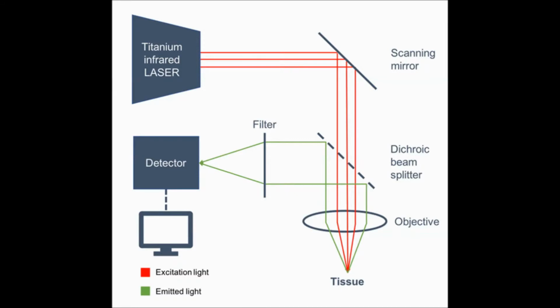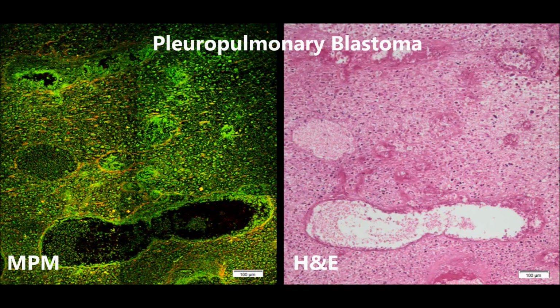This laser scanning technique is already being used in diagnostics in dermatology, but not yet in the operating theater due to the lack of suitable devices. However, this seems technically feasible in the future. So far, multiphoton microscopy has not been studied for childhood tumors and other pediatric indications.